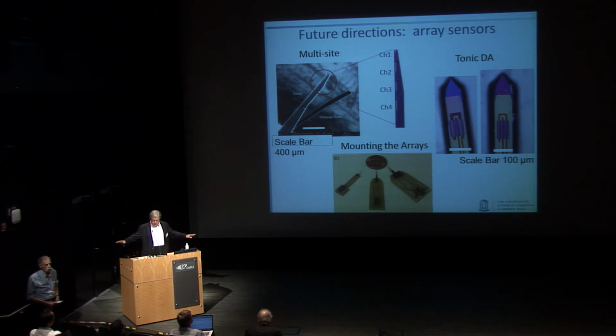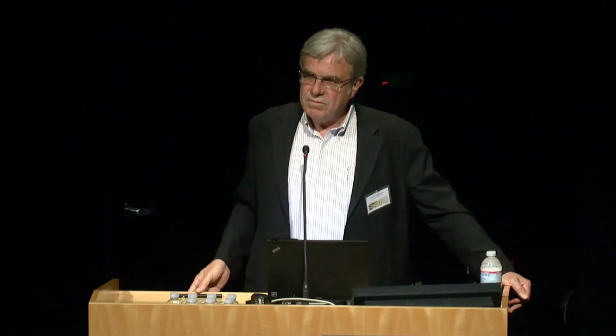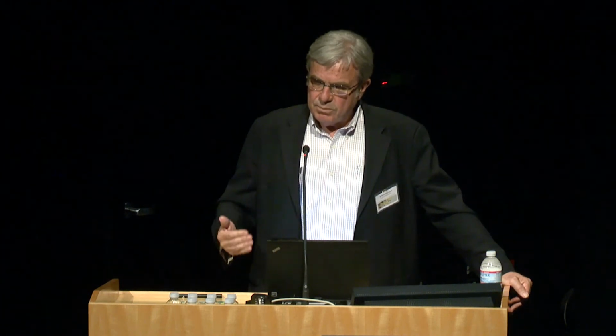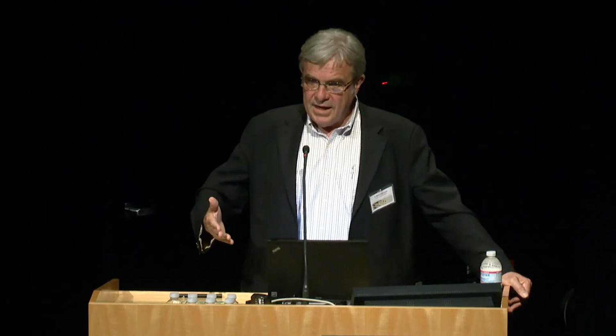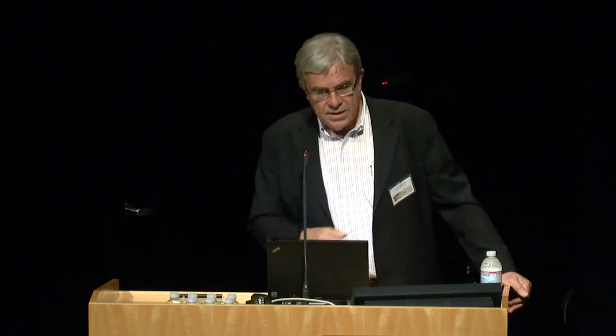Sort of strip out all the dopamine with electrochemistry, let it relax and see how much flows in, and through a differential procedure try and get at the background stuff. The real excitement about dopamine in recent years has been what it does during bursts, and that's what we're ready to answer. What it does tonically may come out of this.